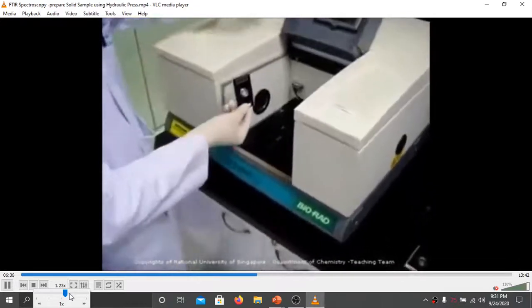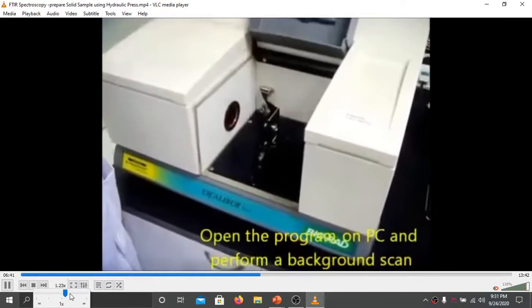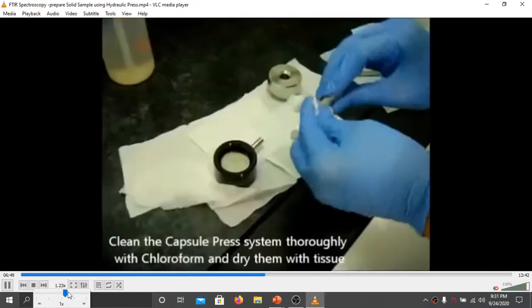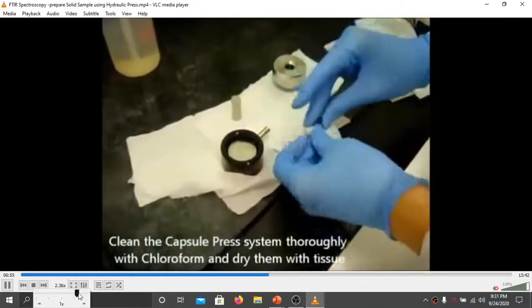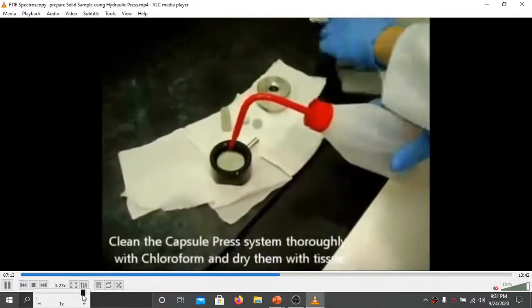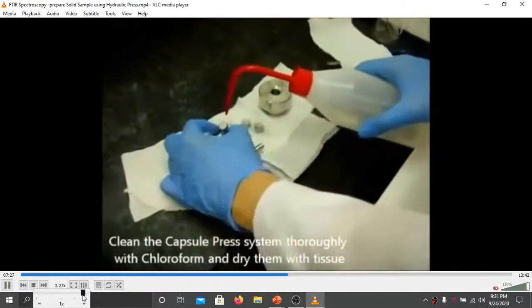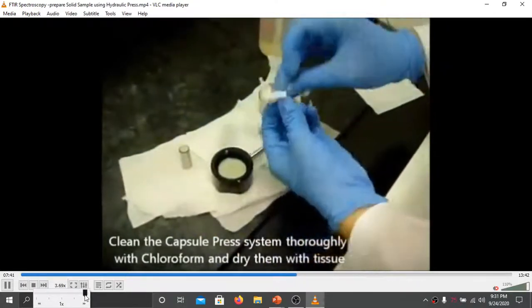It is to be placed in the instrument like this so that it will record the background for the KBr. Now, sample preparation. For sample preparation, the procedures are again the same. Clean every part of the instruments thoroughly with tissue paper first, then with chloroform. You have to clean it thoroughly. Then you have to wash with chloroform. Again, rinse to dry.